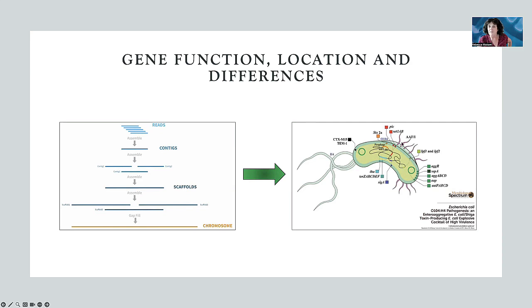H4 is in the flagella. Remember, O104 is on the surface of the bacterium. And here is STX2, that's that Shiga toxin gene, and it's showing that it's right here on the bacterial chromosome. But when you annotate it, you can see that there are a lot of other things in there that are important virulence factors that we need to know about.